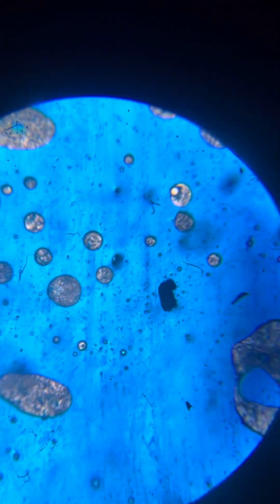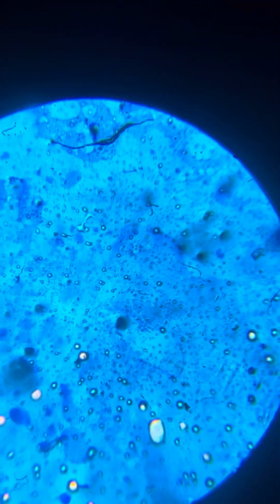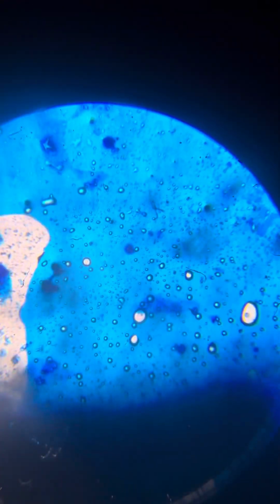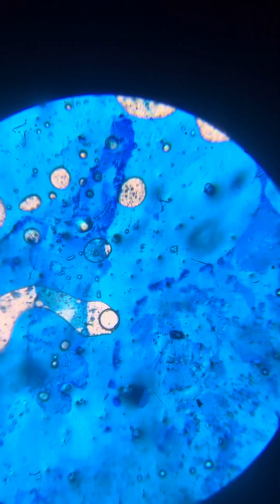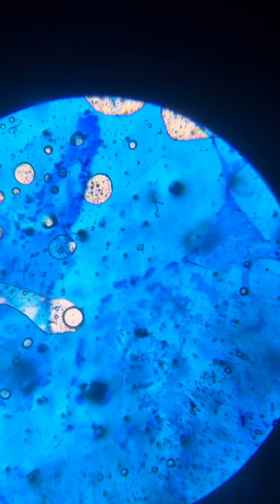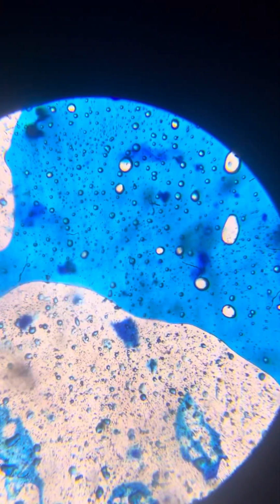So now we see much more. Actually, it's the same slide as before, just with the staining. Of course, it's not the same formation because the oil moved, since the liquid moves inside. But we see much more now that we've stained it with the blue coloring.